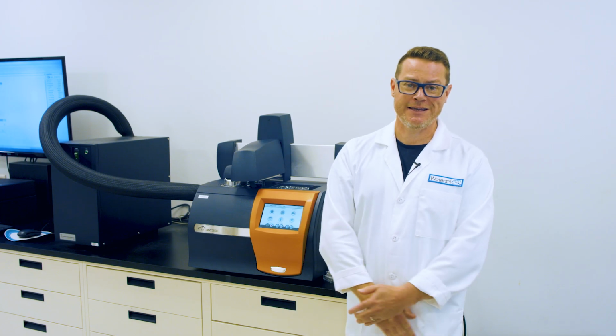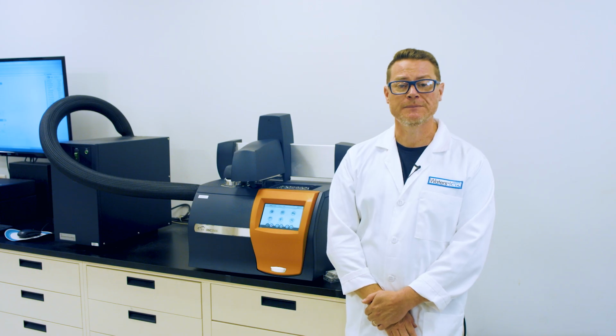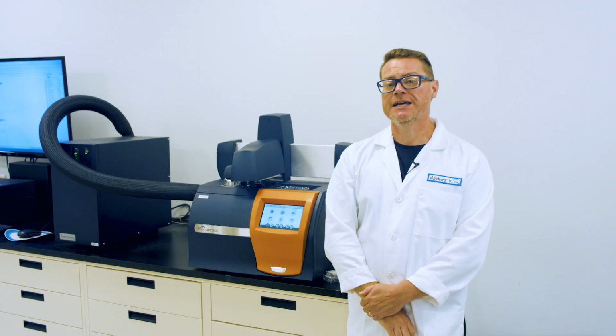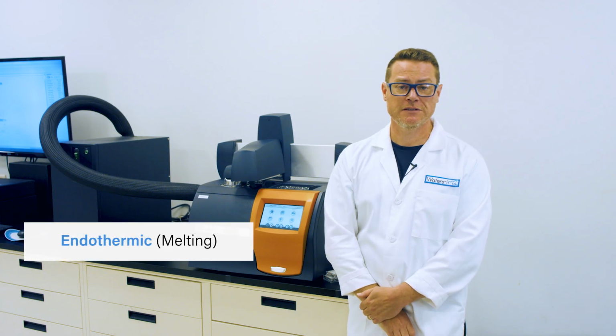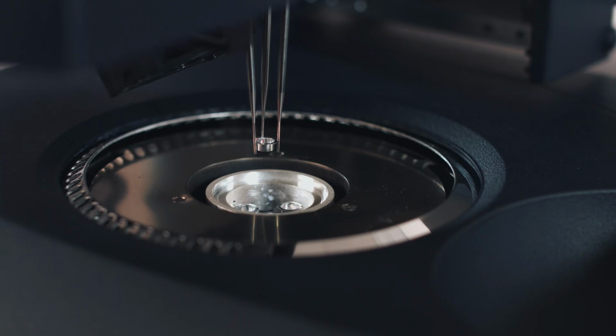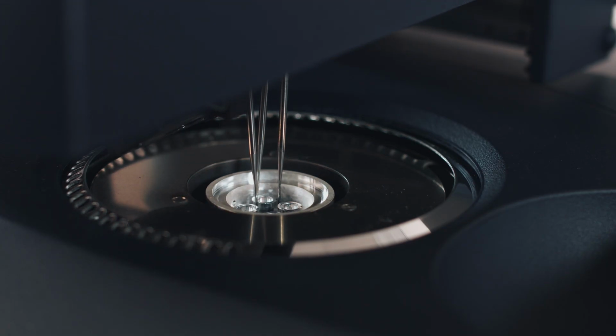In the more likely case that the sample does undergo a phase change, then we will see something, typically a peak. That's because a change in phase will be either endothermic, in the case of melting for instance, or exothermic, in the case of crystallization. Since a lot of samples are crystalline, let's consider melting.